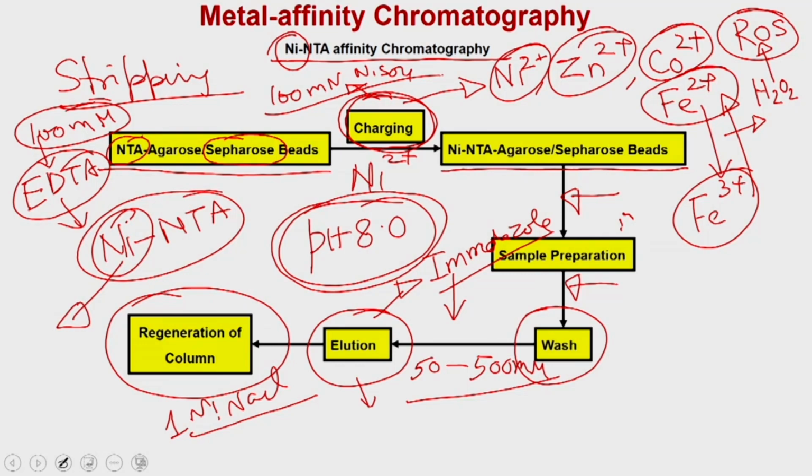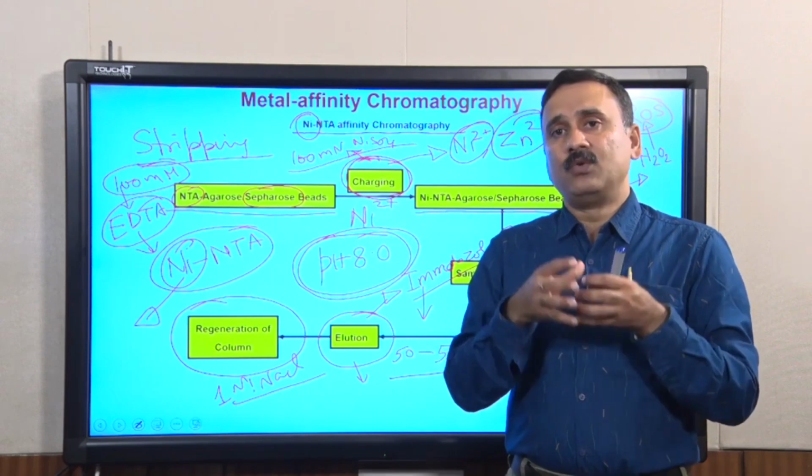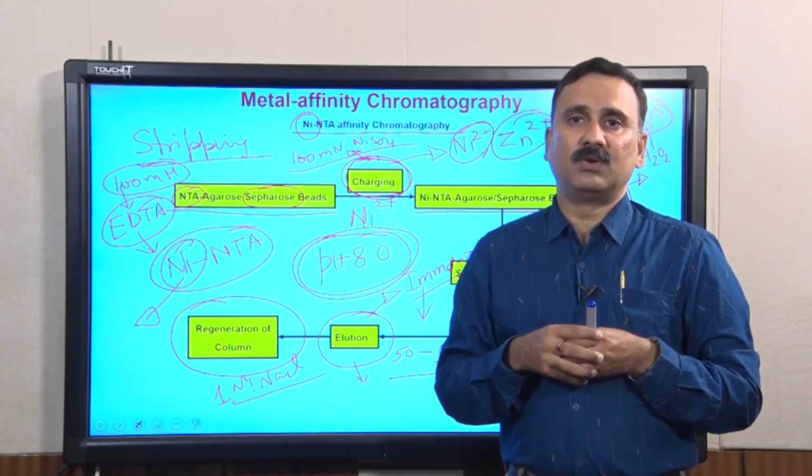For this I would like to take you to my laboratory, where we are going to show you each and every step: how to do the charging, how to equilibrate the columns, and then how to purify the protein using the nickel NTA affinity chromatography.